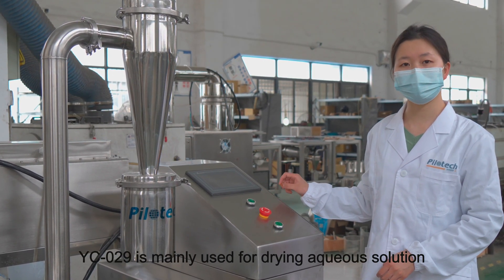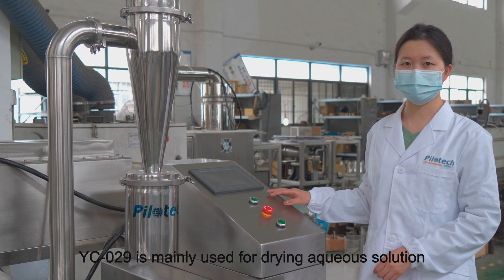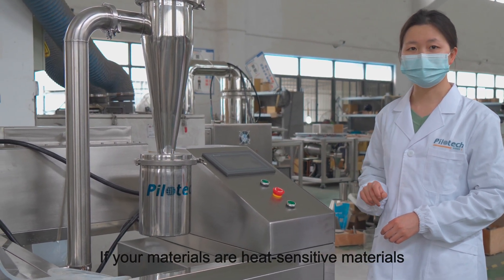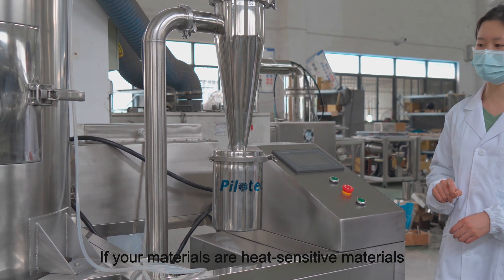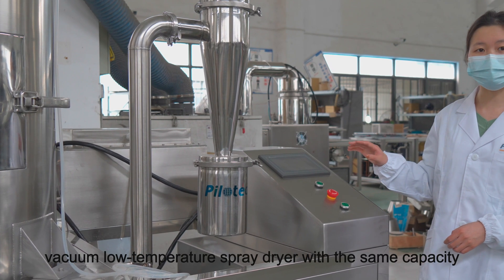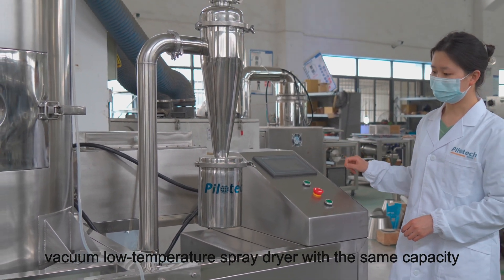YC029 is mainly used for drying aqueous solutions, suspensions, and emulsions. If your materials are heat-sensitive, you can use the YC310100 vacuum low temperature spray dryer with the same capacity.